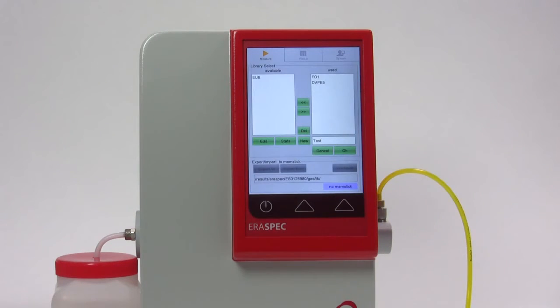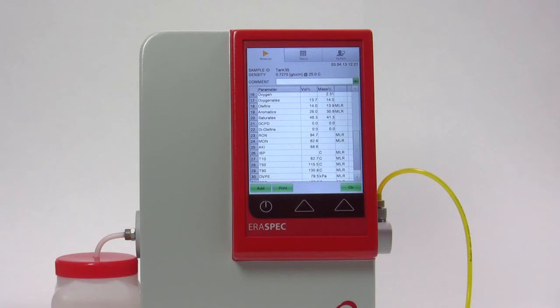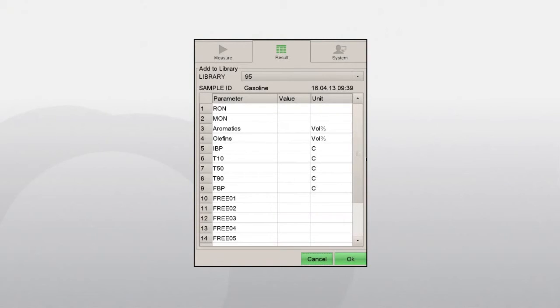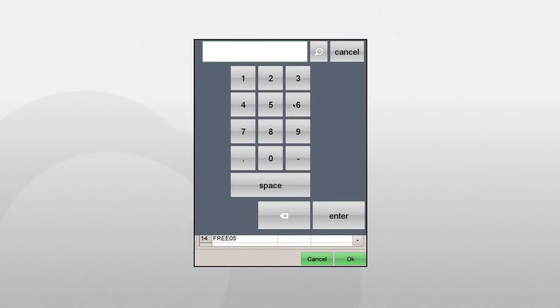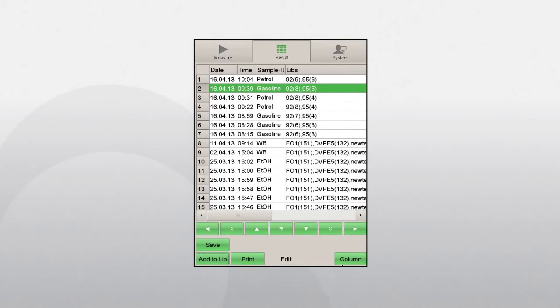Enter the name of the new library and press the button New. It is possible to add a sample directly after a measurement by pressing the Add button, or at any time later from the result memory. Select the desired sample and press Add to Lib. Select the library to which the sample shall be added from the drop-down list in the first line. Then enter the values for all parameters of interest that are available, as determined by the respective reference methods. Press OK to store and add this sample to the selected library.